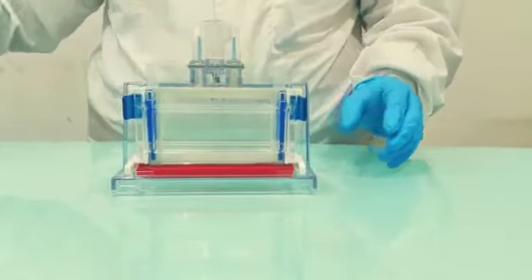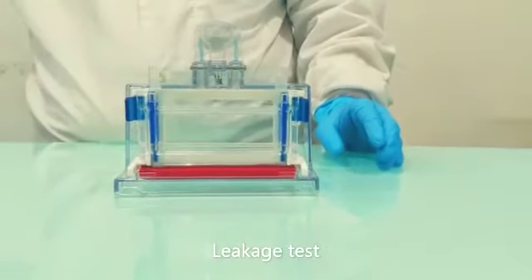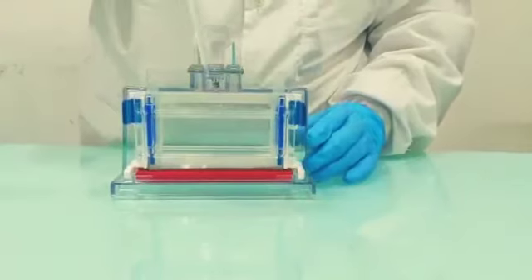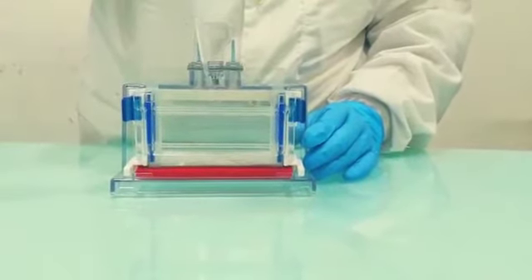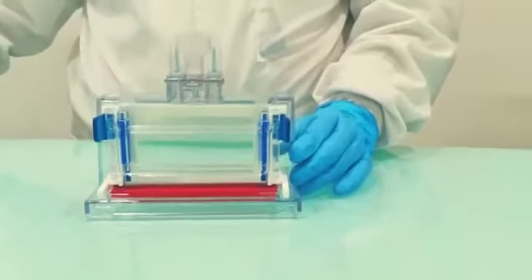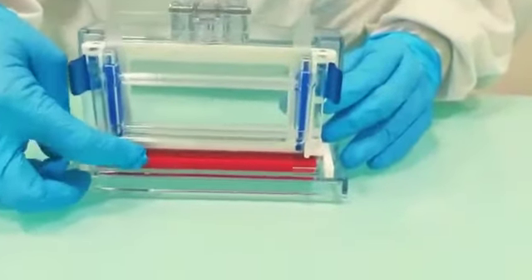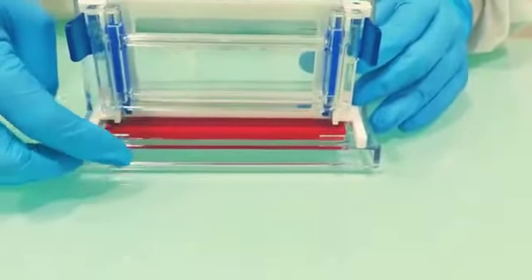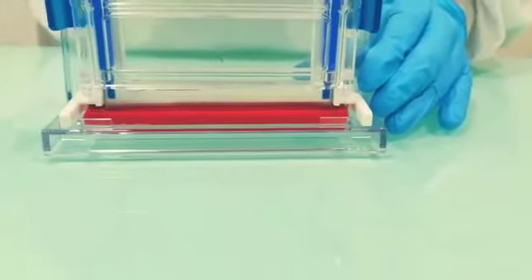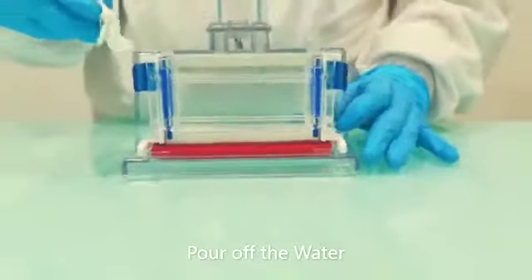Now next, we will do a leak test by adding a small amount of water. As you can see, the plates are not leaky. So therefore, either you can directly pour out the water or you can use a filter paper.